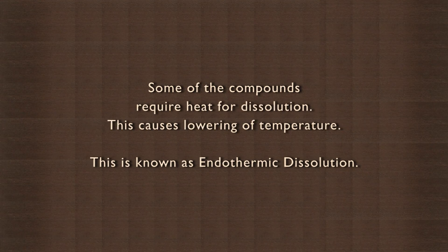Some compounds require heat for dissolution. This causes lowering of temperature, and this is known as endothermic dissolution. We will try out three dissolutions and see which of them are exothermic and which are endothermic.